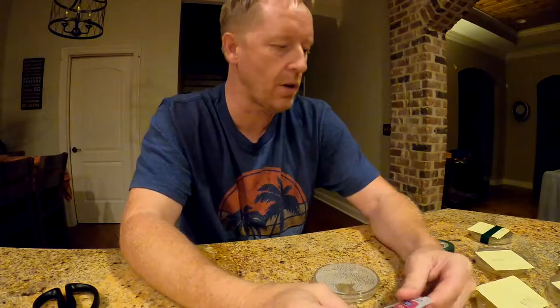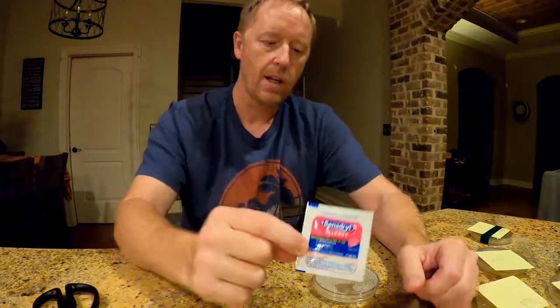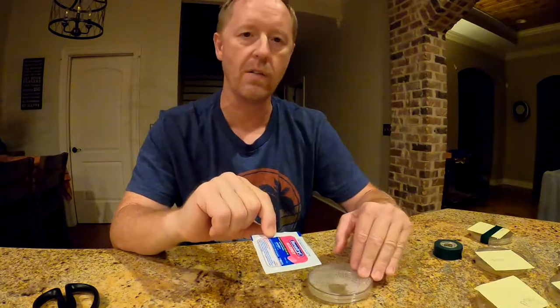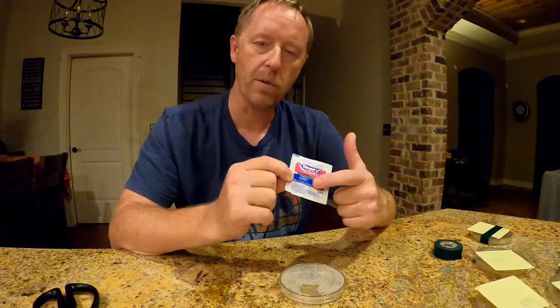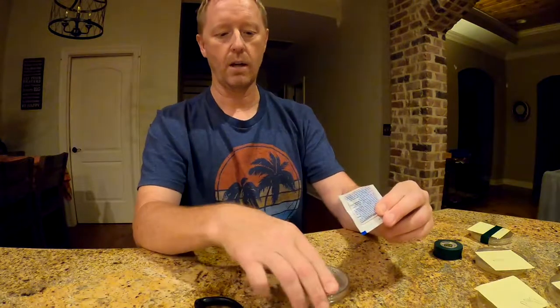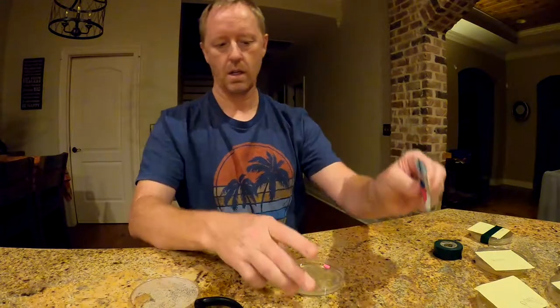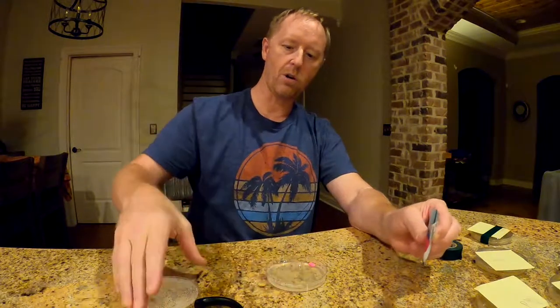Most people think when you buy medicine it's completely sanitized. So we're taking a Benadryl pill from an unopened package and dropping it directly into an agar tray to see what sort of bacteria grows just from the pill itself.